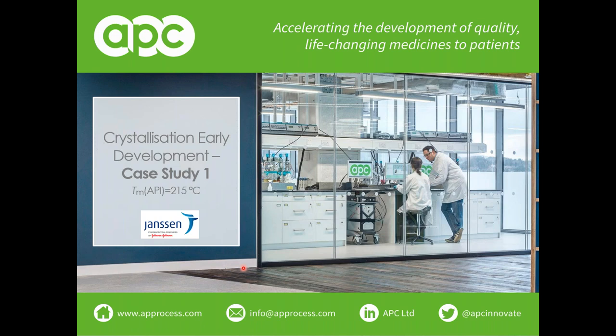So now I'm switching to the case studies. Our first case study is an API with a very high melting point, 215 centigrade. Here you can already see, just by looking at the melting point, that the compound probably will be poorly soluble in most of the solvents, since the API is quite stable in the crystal lattice and doesn't like to disintegrate, dissolve and mix with the solvent.